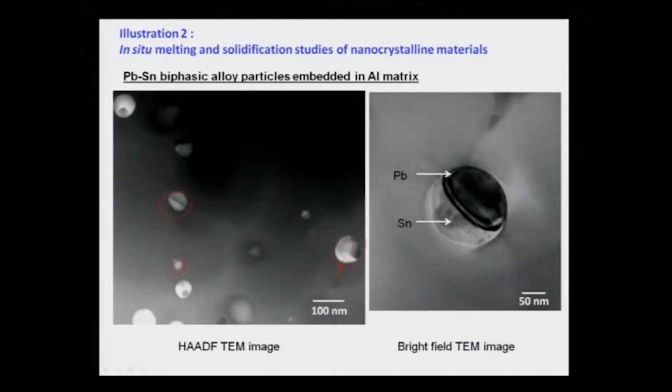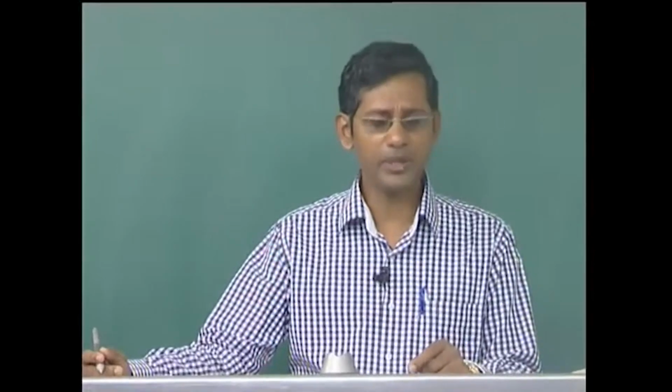One has to understand that nano beam electron diffraction depends on the available intensity of the incident beam, because the particle is not so thin, and the diffracted beam intensity may not be sufficient to be recorded by the recording device. So, in many cases, we use a fine beam which has very high intensity and allow it to fall on the specimen, and then the diffracted beam is collected. One advantage of this is that one can obtain information from a large number of particles this way, and get full scale diffraction information from the particles.